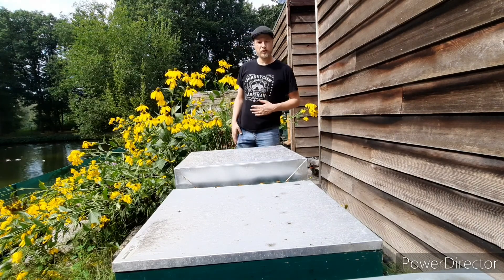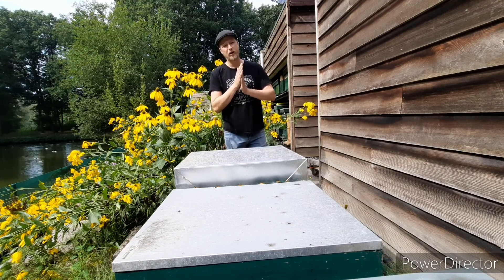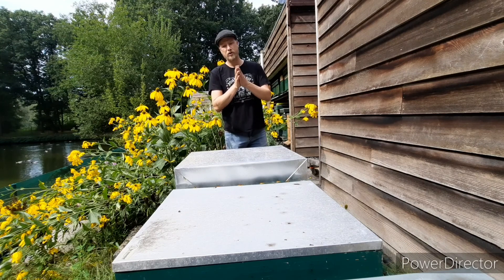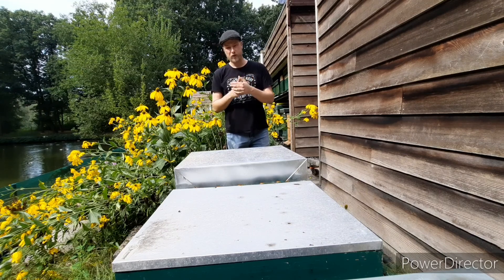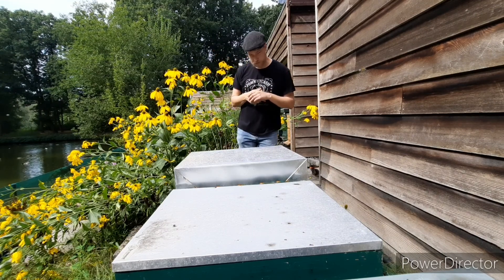Hello and welcome to Annabies and Orchids. Today we are going to take some samples from the purebred queens to test the varroa mites that are currently on the bees. It's one of the three ways we test the infestation of varroa mites.